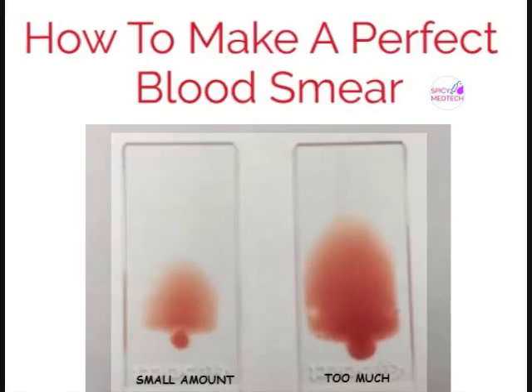The next is the amount of blood. The left slide's smear is too small and too light, while the right slide is too dark and too thick for proper microscopic evaluation.